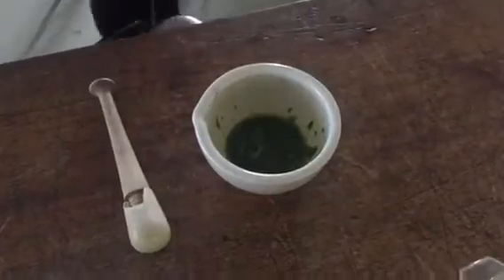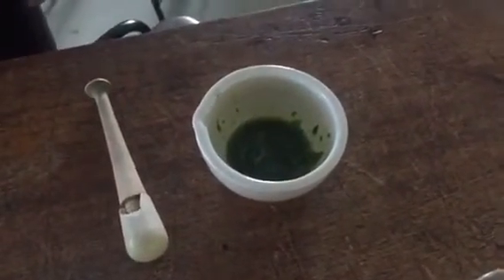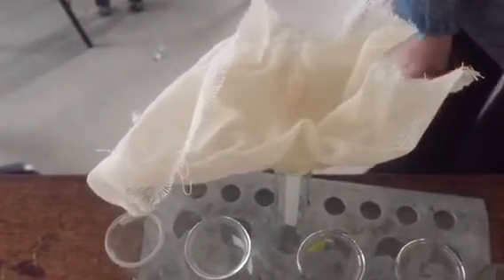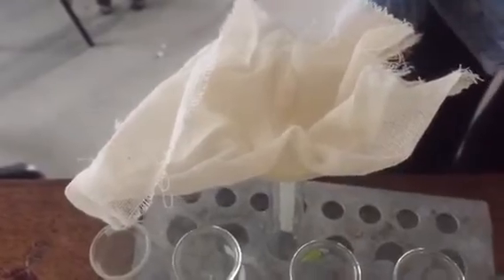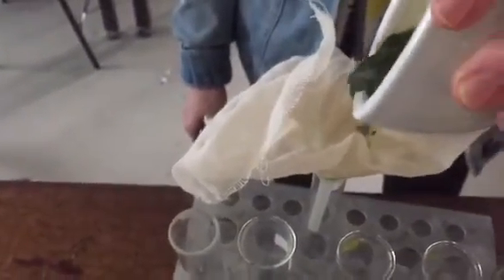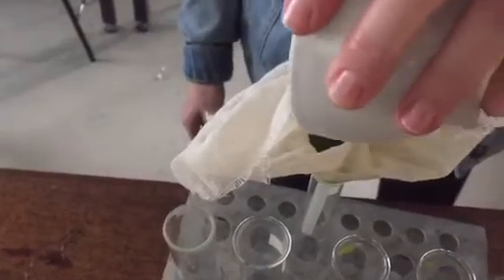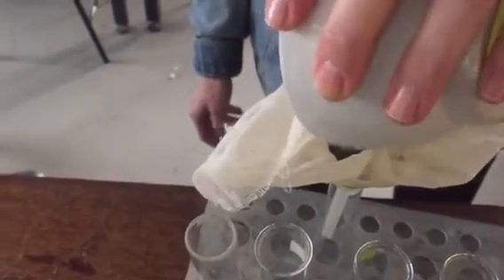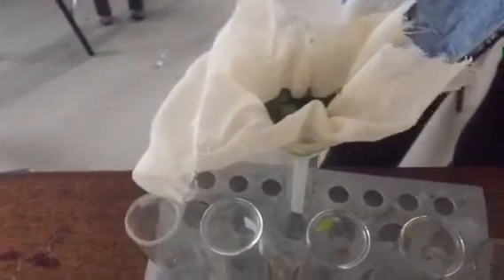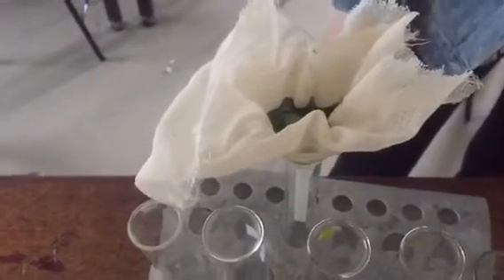We have finished grinding up our spinach and now we can transfer it to our filter with some muslin. Don't use filter paper for this because filter paper will just block up. We pour our mixture in to get rid of any of the large pieces of leaf that are still in there. If it doesn't go through very quickly we can just gather up the muslin together and give it a bit of a squeeze, and that will push the liquid through.